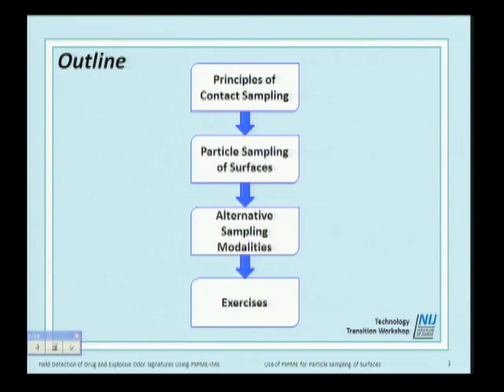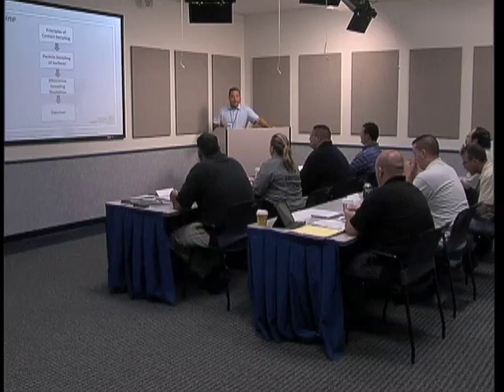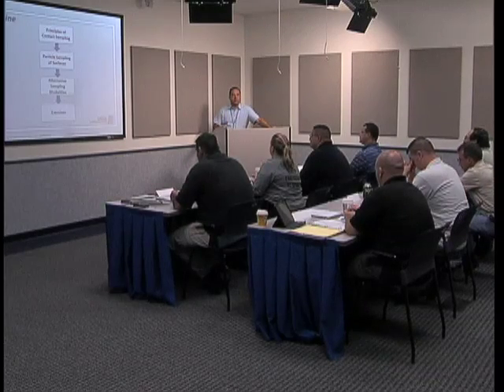And the other thing you heard from Patty earlier this morning was that the substrate mattered quite a bit. So the force for lifting particles did not matter as much as the composition, the texture of the substrate. So there's been a lot of work, people developing different materials for removing particles. So now we have the ability to do non-contact sampling with PSPME and the possibility for particle removal using contact sampling. So we're going to use PSPME in the laboratory for that function.